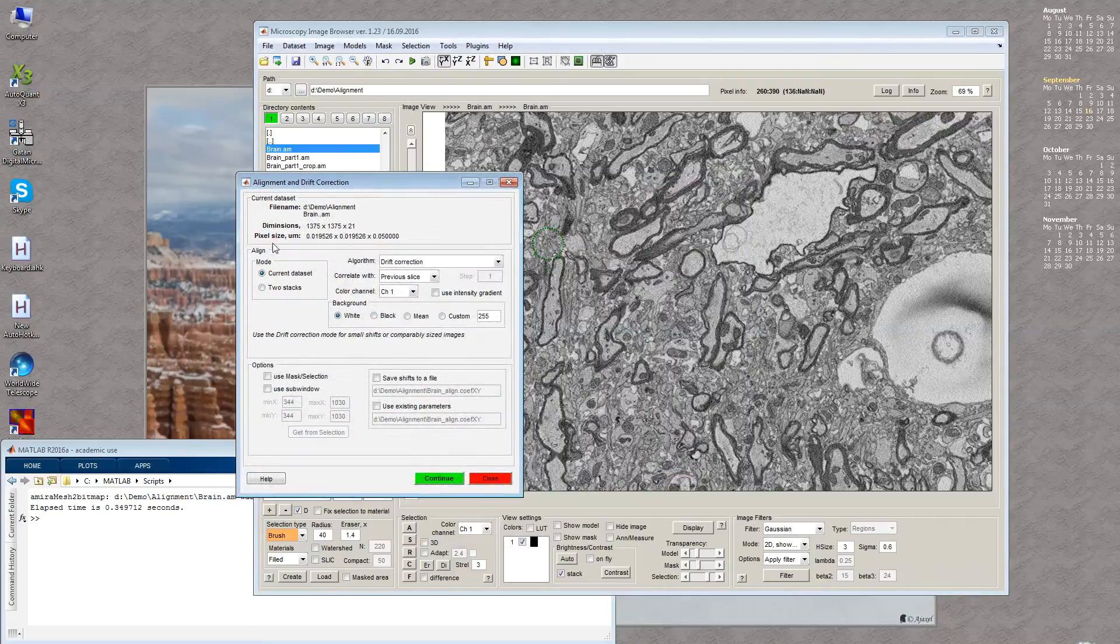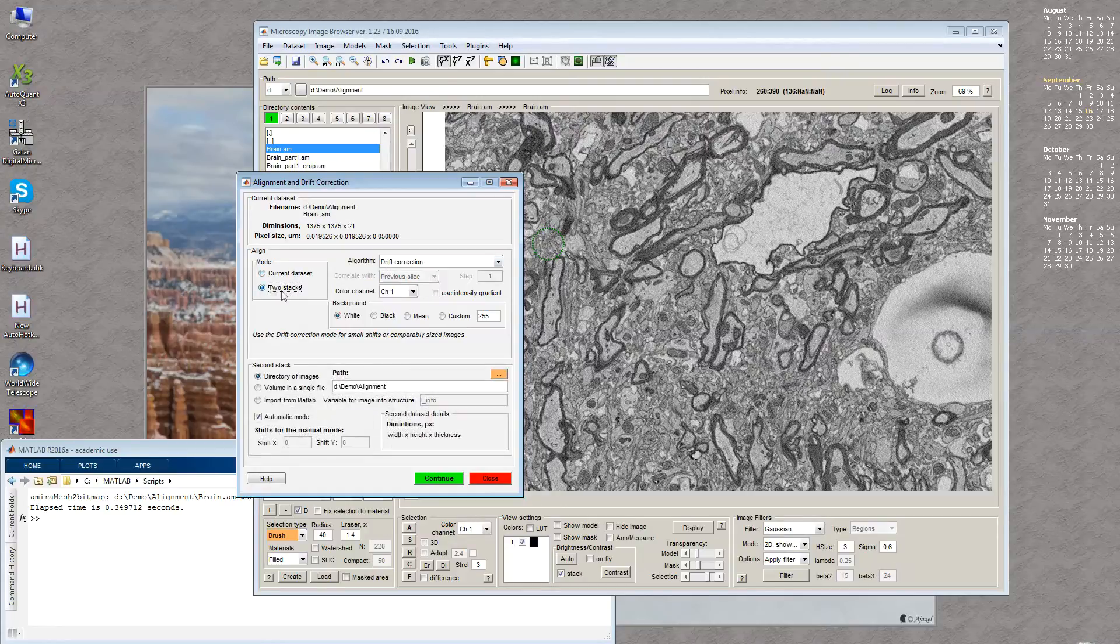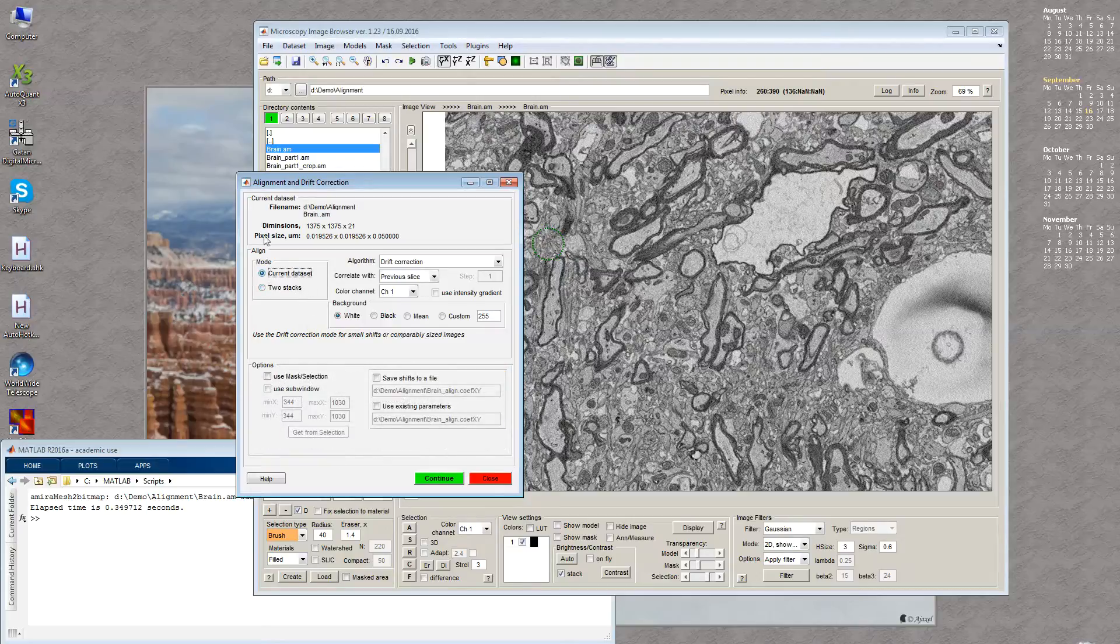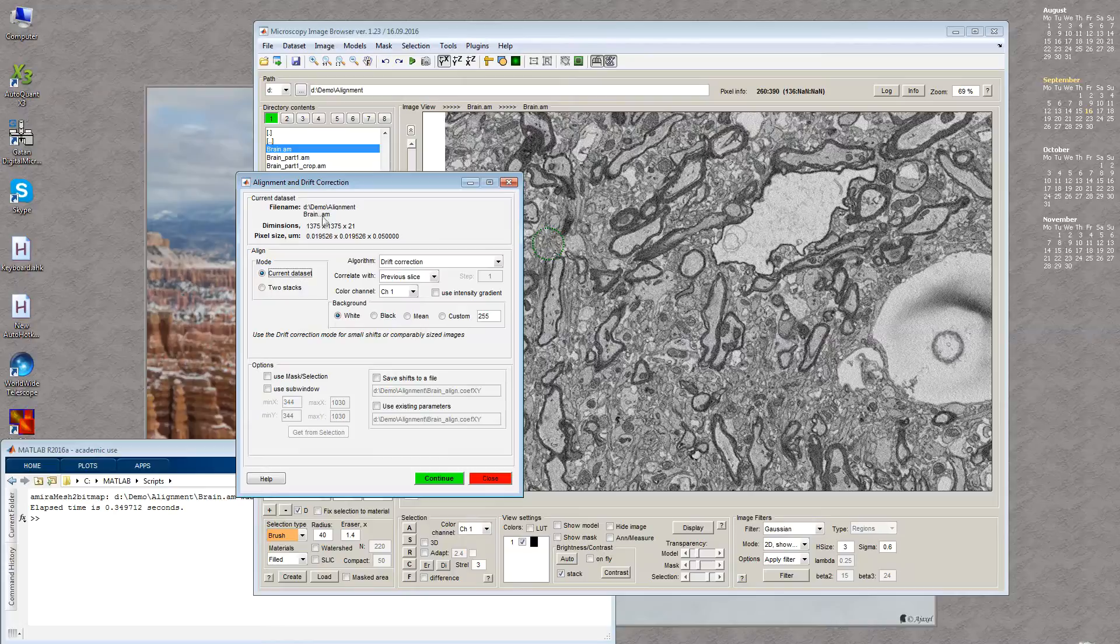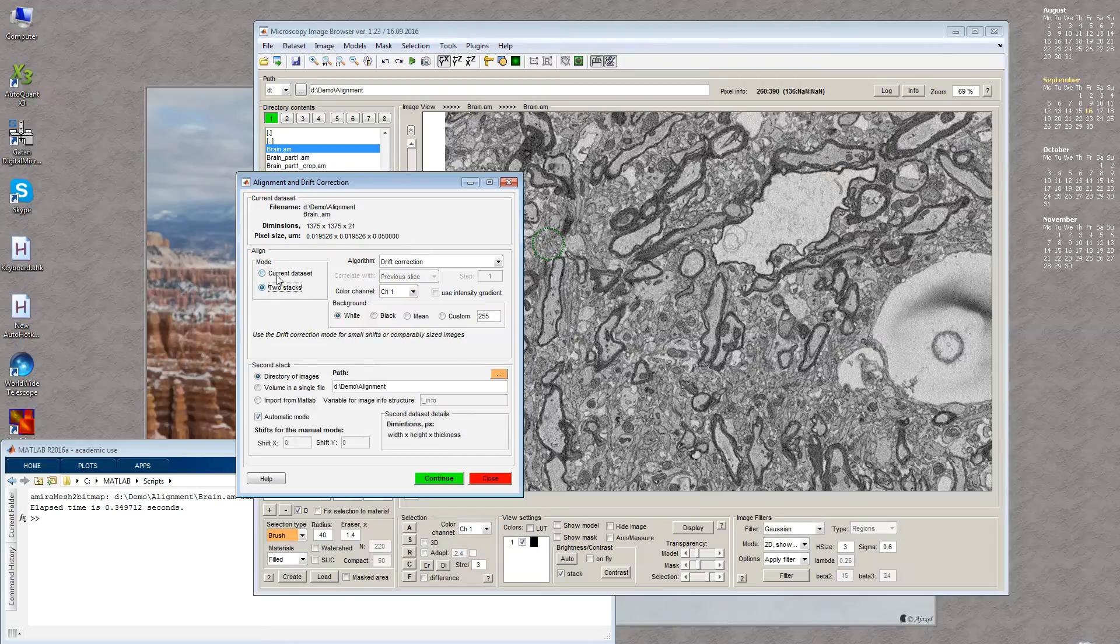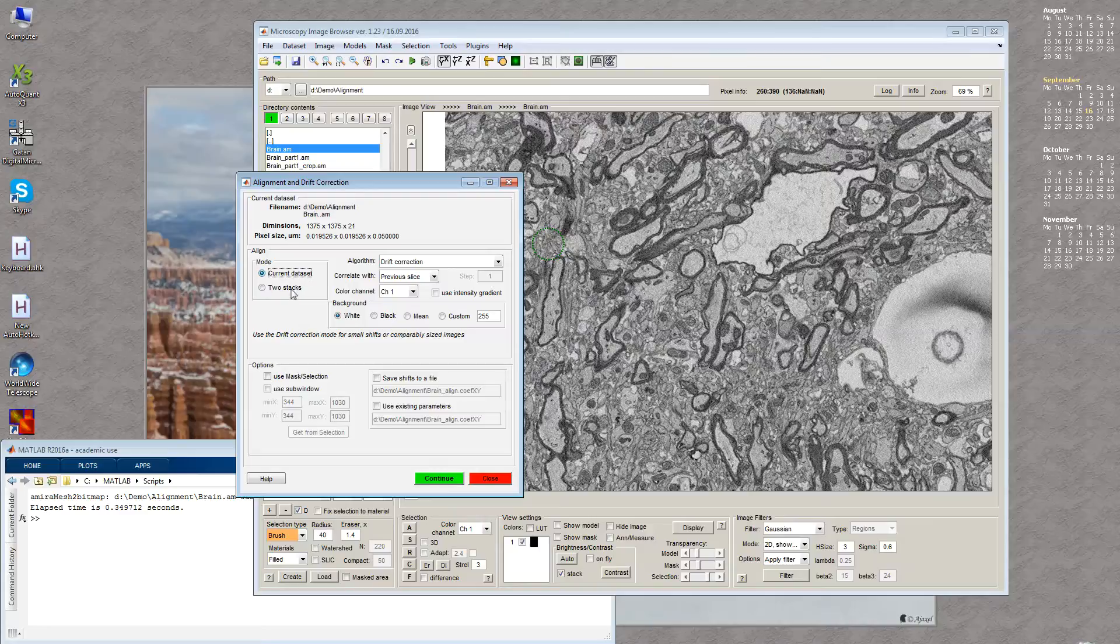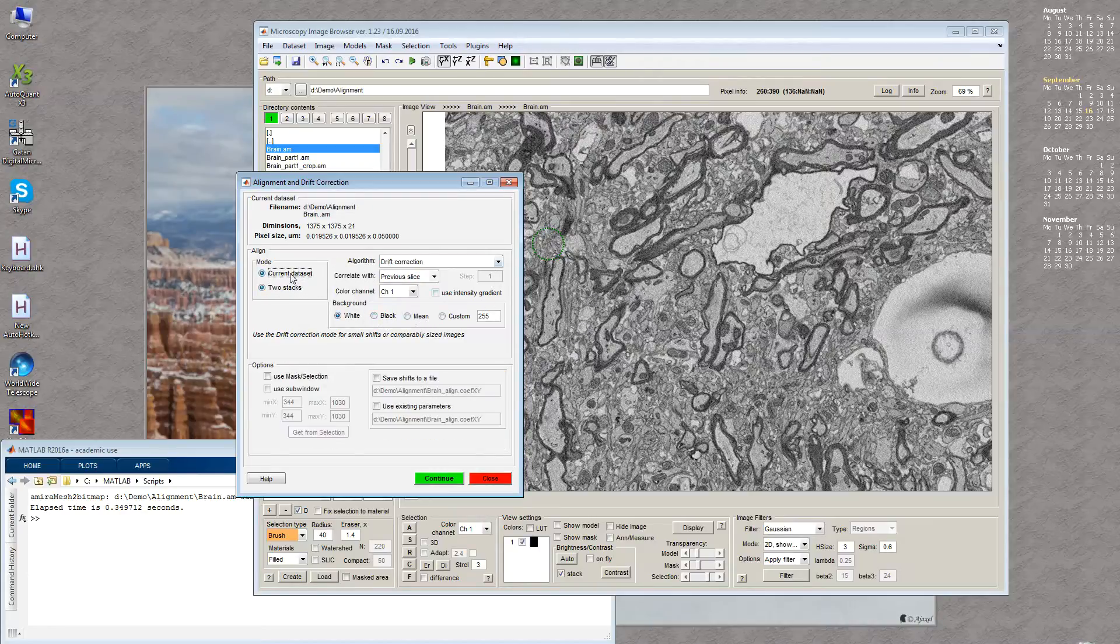There are a number of options, but in general using this tool you can align either the currently open dataset or align two stacks, one which is open and another which you can load from disk. There are three panels: the top panel called Current Dataset shows details like dimensions and pixel size. The second panel is called Align and allows us to select the mode and algorithms.